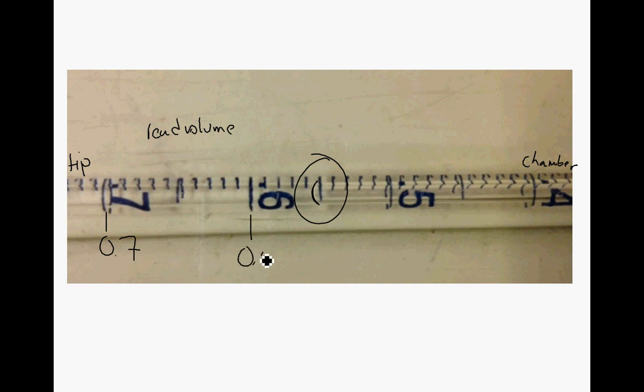So this is the setup. Now, when that water moves into the tip of the pipette, the tip of the pipette is here, and the chamber is going to be on this end. You see that right here is the meniscus. And so you want to read the volume using this graduated pipette tip. Notice that this line right here is 0.7, this line is 0.6, and this line is 0.5. So what is the volume if the meniscus is right here? What is that volume?